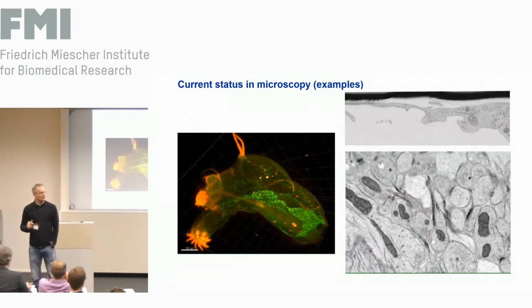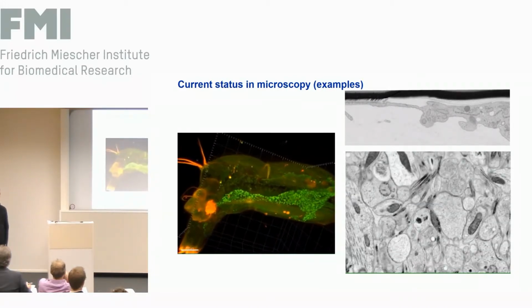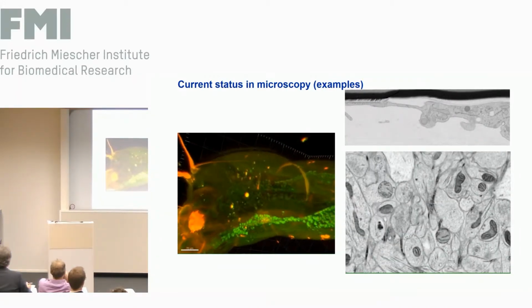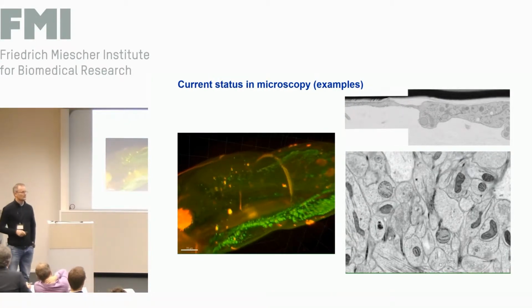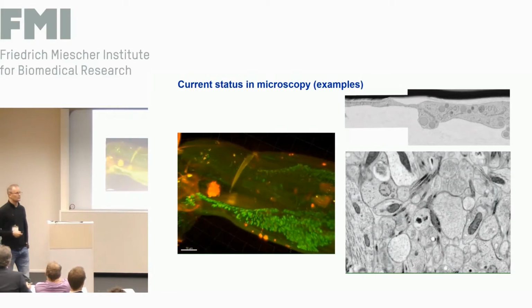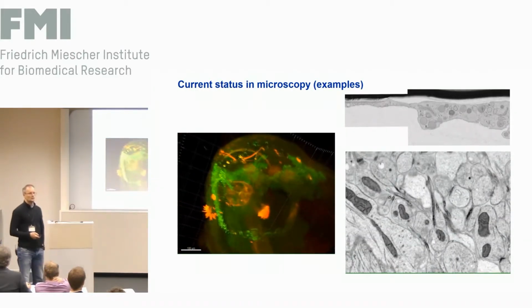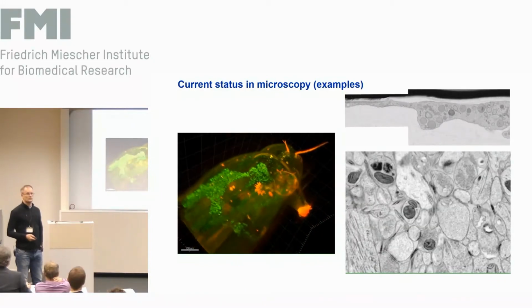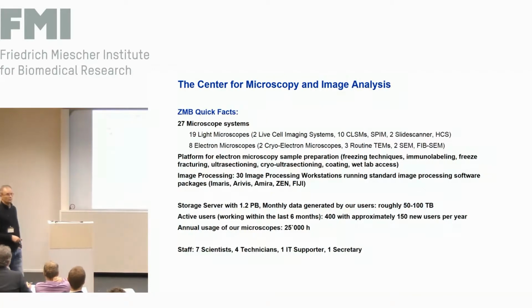And that actually has been the start when we thought about how we can help people analyzing data. Because the data is large, 1 terabyte. It's gigantic. You cannot transfer it to the server. You don't have a server, you don't have a workstation. That has been the initial start. And you will see in the end that actually I don't think that's really the problem.